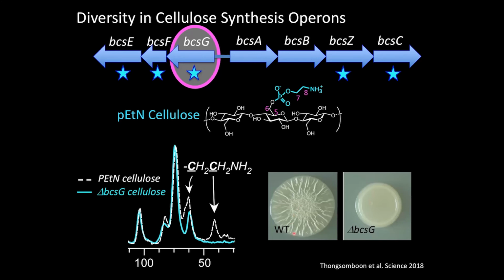When bacteria are forming biofilms, you can grow them on an agar plate and they elaborate these hallmark wrinkles like this. This is the size of a small coin. You could see this by eye if you were looking at it. And without the modification, they don't wrinkle. So clearly this zwitterionic modification, phosphoethanolamine, is required for interactions with those E. coli polymers.